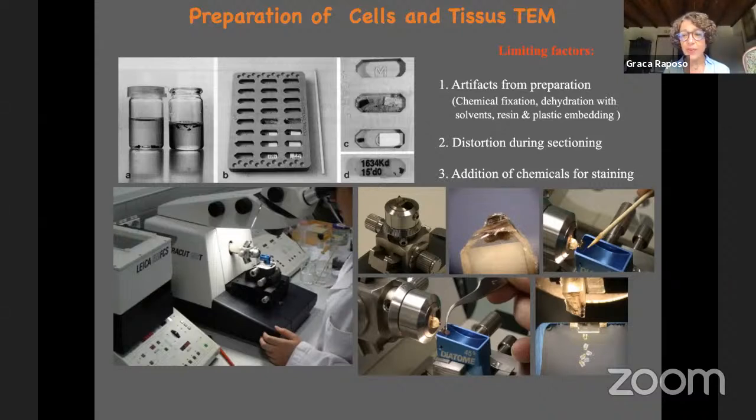You know, it's very homemade. You have an eyelash that you put on the hood and stick just to manipulate this. Although everything is about to be automatic, you cannot just leave the microtome working alone, of course. So here it's a diamond knife.